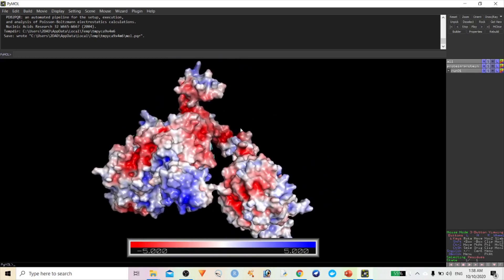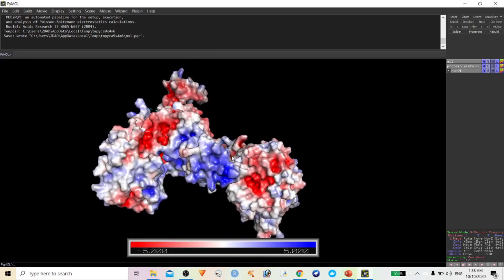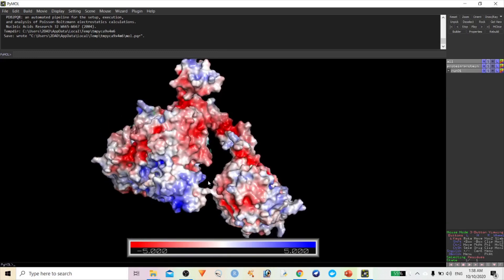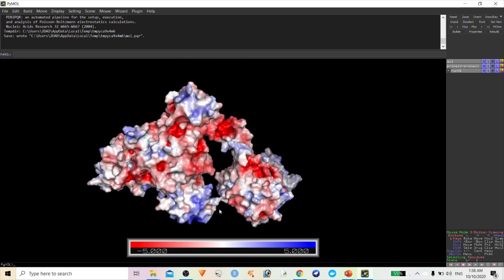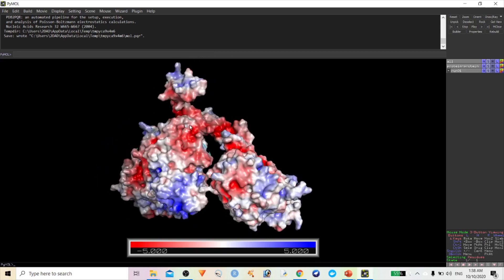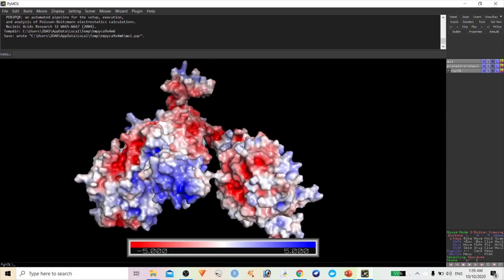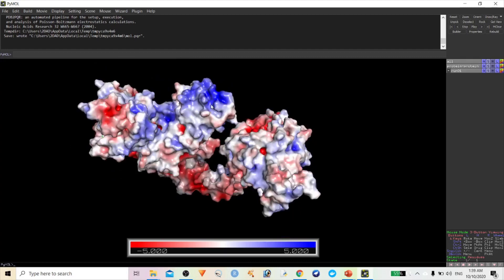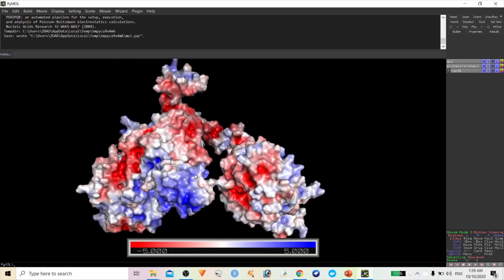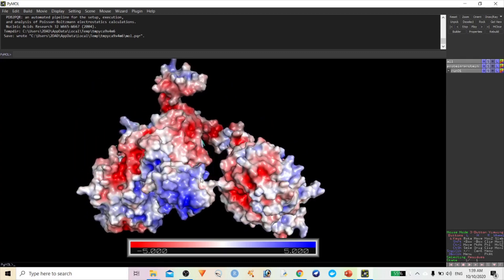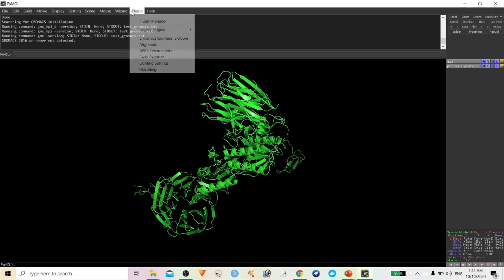The positive charge and negative charge amino acids are represented with different colors, showing the distribution of charge in your protein. You can easily analyze this by using electrostatic potential analysis.